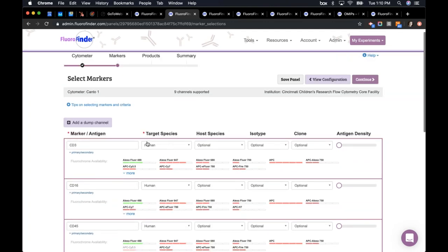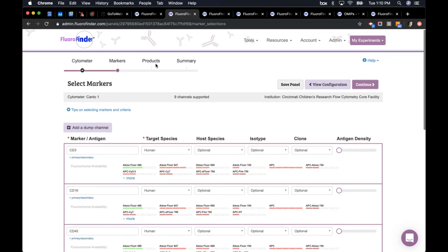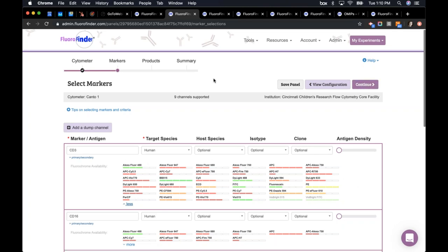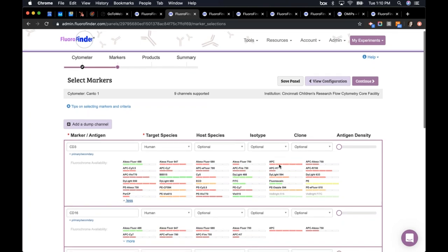Once you've got your markers in, the only thing FloraFinder requires is that you add your marker and your target species — here I've selected human. There are some additional optional filters. Looking at my CD3 human products, this shows some of the fluorochromes that have CD3 human products conjugated to them in FloraFinder's database.